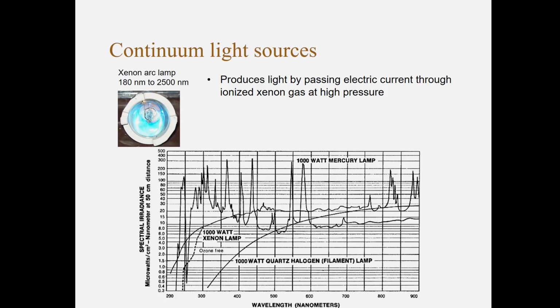And this plasma emits light, preferably in the visible range, up to about 700 nanometers. And then this very strong current of electrons hits an electrode, and this electrode heats up, and above about 700 nanometers, this is the main contributor to the light emitted by this source.